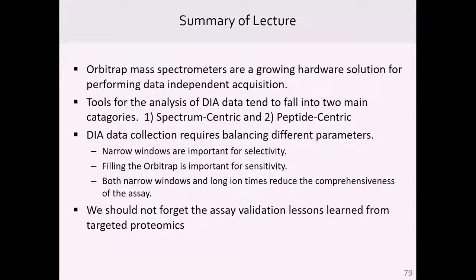We also found that adding a much higher concentration of trypsin helps in a lot of these samples. So in cases like plasma, you have to basically shovel in trypsin because there's a lot of endogenous protease inhibitors. So we often add a 1 to 10 as opposed to a 1 to 50 enzyme to substrate ratio that people often use, which we learned from those digestion kinetics. And then we were able to get those curves to come back up again into the 5 hour type range.